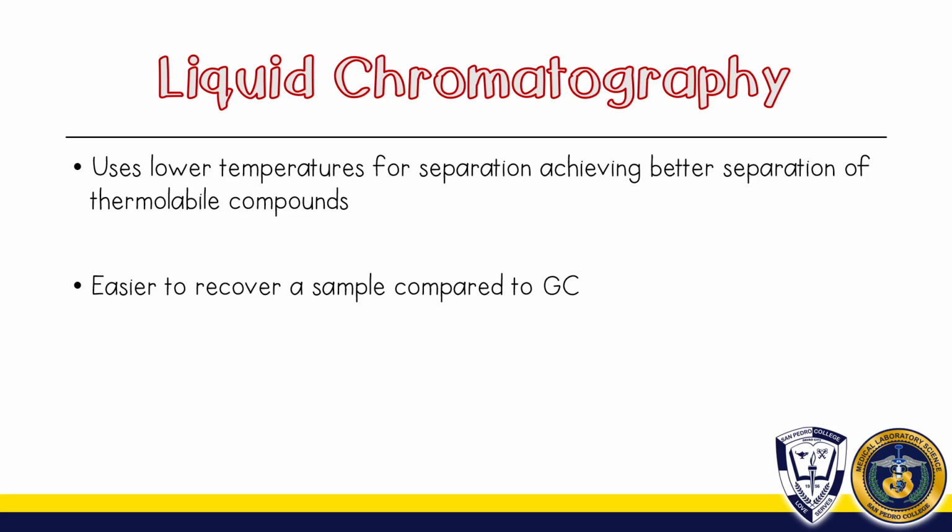And actually, liquid chromatography is commonly used and is a suitable alternative to gas chromatography, because as mentioned also, not all compounds are volatile. Some are too unstable and some are insufficiently volatile to be assayed using gas chromatography. So that is why liquid chromatography is preferable.